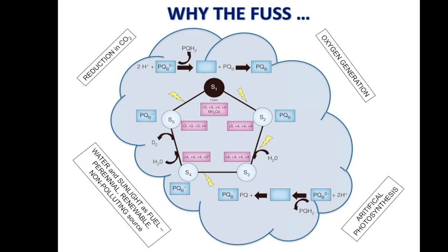I don't know. Of course, the resolution that we have from our data is about 5 angstroms, so we can't justify it firsthand, but the idea with which we feel we are consistent in our argument is that the plastoquinones form an important contact point when they form crystals of PS2.